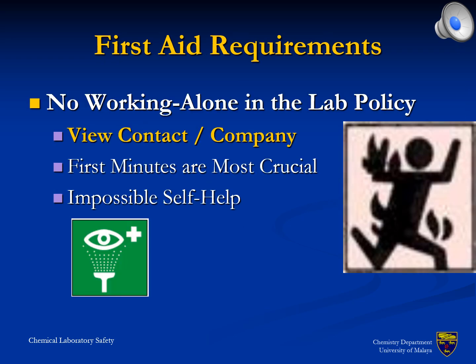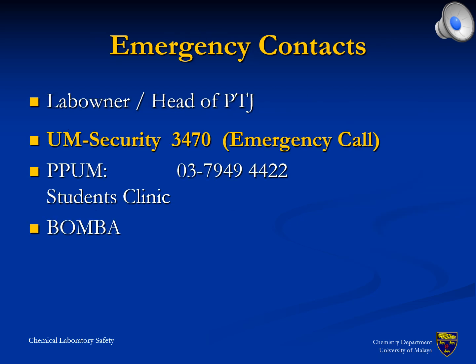Working alone in a chemical laboratory is not allowed. The reason for this constraint is the requirement for someone else to provide first aid in case of an accident. The most illustrative examples of accidents, which require help, are a person on fire and a person with a chemical spill inside the eye. In both cases, the affected person is incapable of helping him- or herself. Emergency contacts must be placed easily accessible inside a laboratory, typically near the telephone.